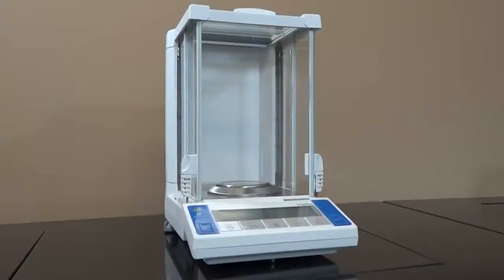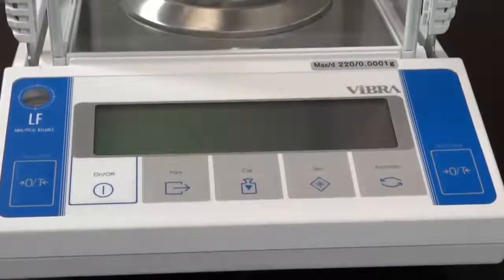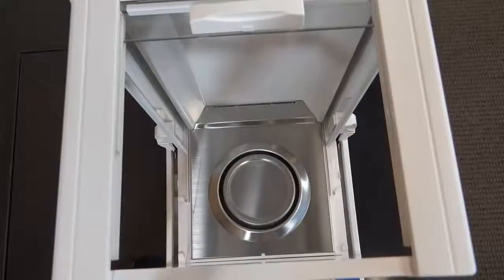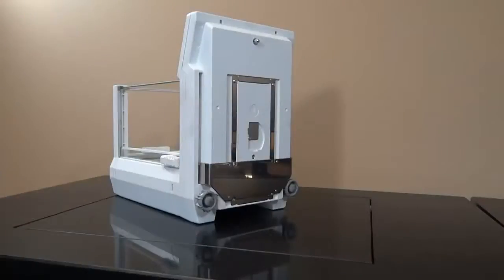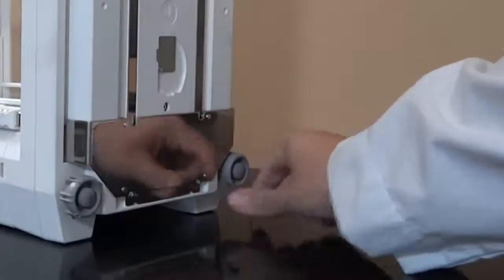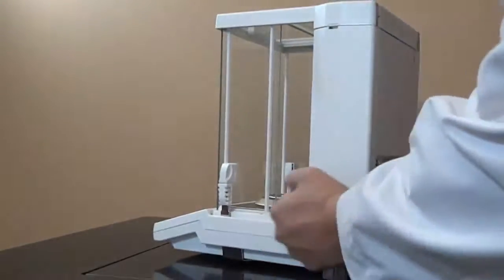The LF-225DR Semi-Micro Balance and the LF-224R analytical balance are produced in Japan and made with exceptional craftsmanship and attention to detail. Starting at the bottom of the balance, there are three support points, two of which are adjustable to provide leveling. The solid frame of the unit provides stability and robust construction to protect the mechanism.